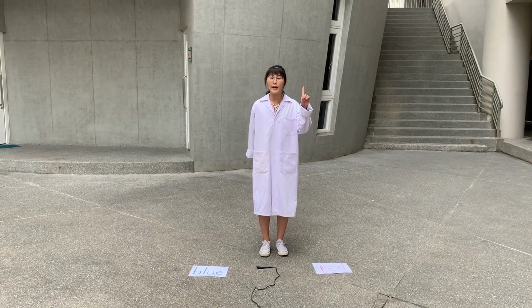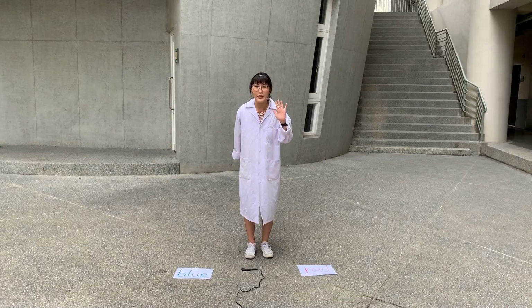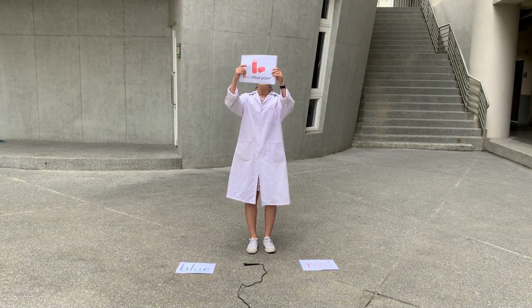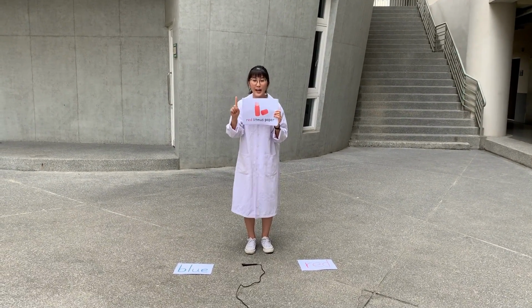So, number 1, coffee is acidic. Very good. I'm using the red litmus paper. 3, 2, 1, jump.